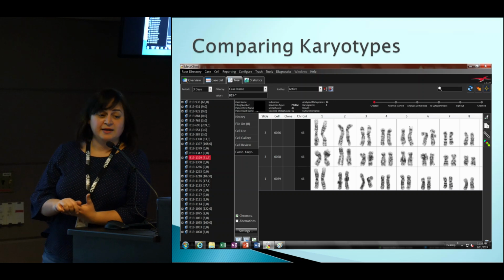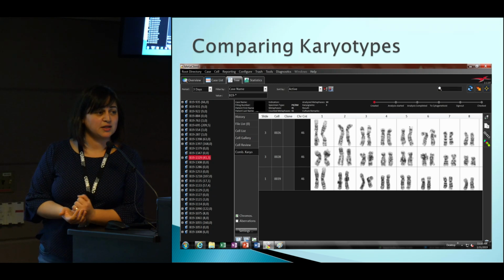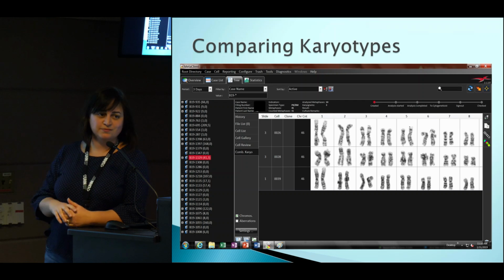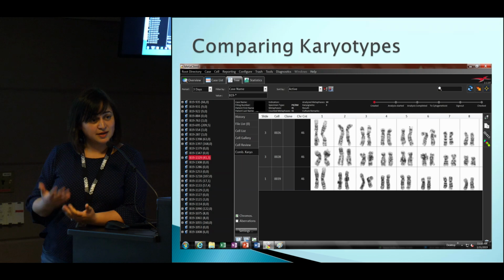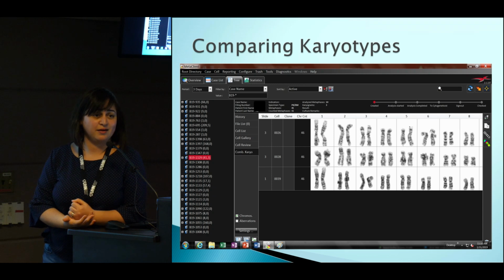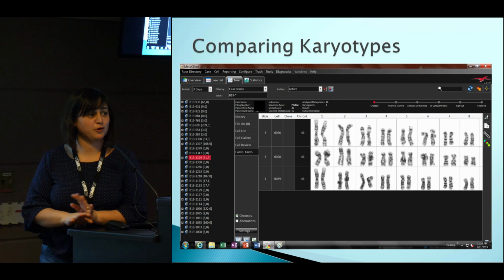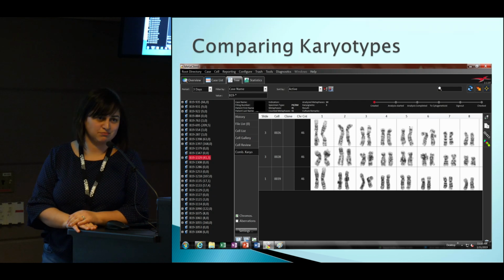So an analyst, when they start the analysis, will move the bar to analysis started, and that will stamp their name and the date they started the case. The same goes for the checker. And then once the director gets the case and signs out their report, they will move this bar to checked, and that will stamp their name and the date they did that. And the case will be locked, so no more changes will occur to the case unless we really have to.